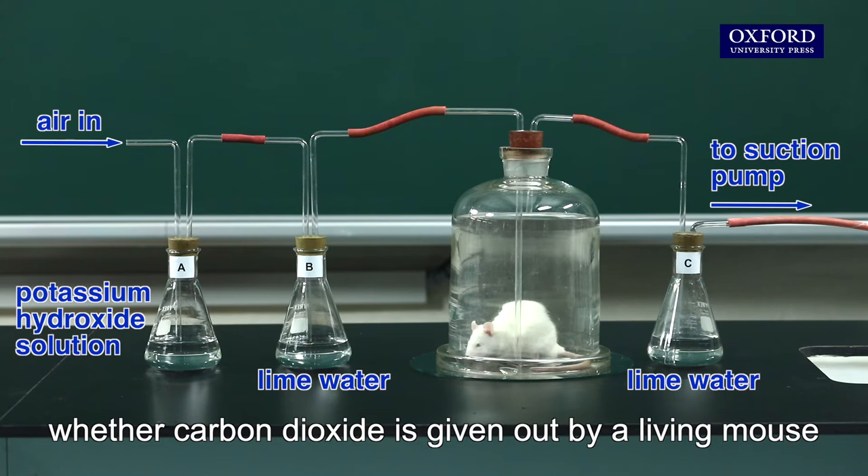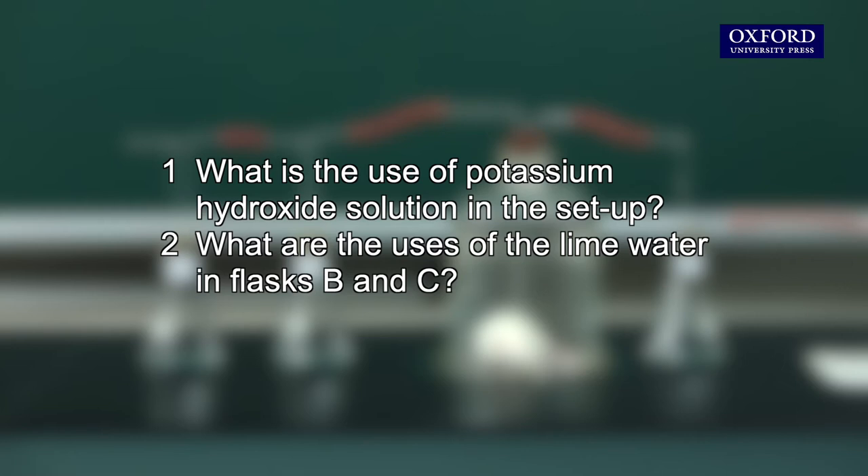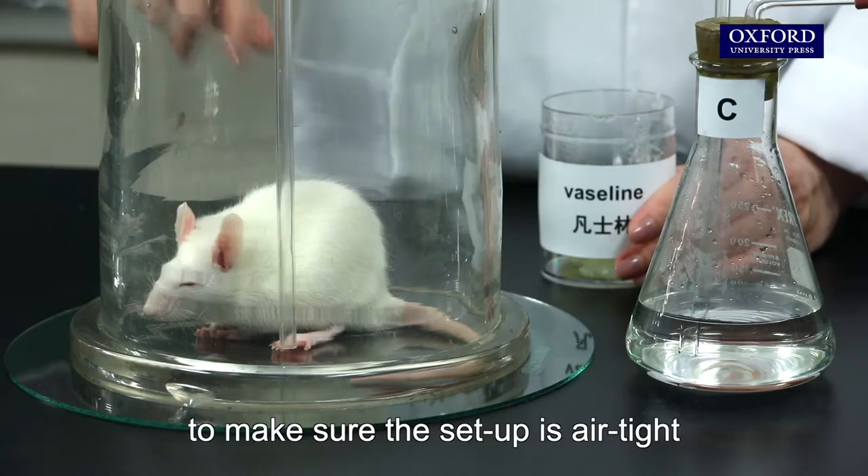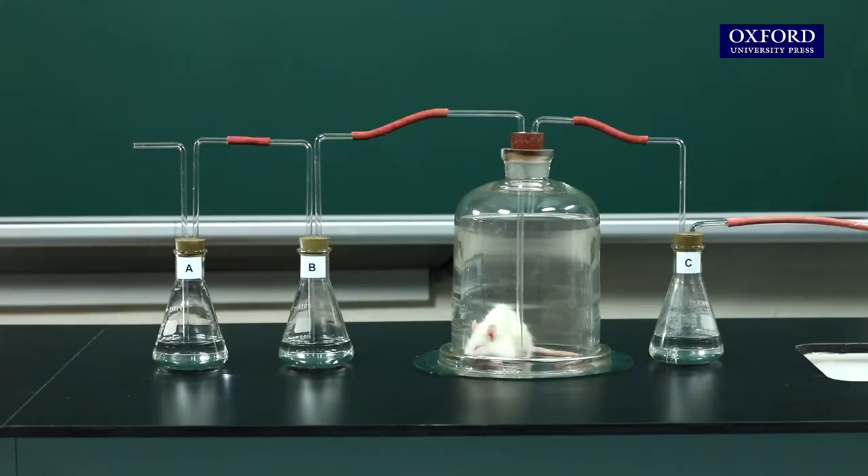This apparatus can be used to find out whether carbon dioxide is given out by a living mouse. When setting up the apparatus, remember to seal off the edge of the bell jar with Vaseline to make sure the setup is airtight.